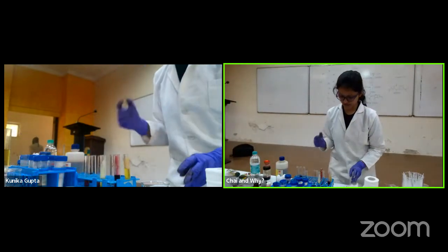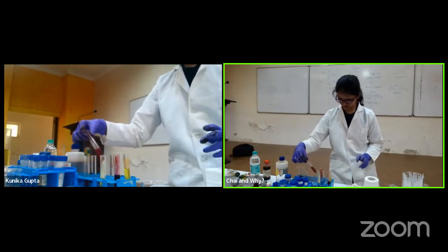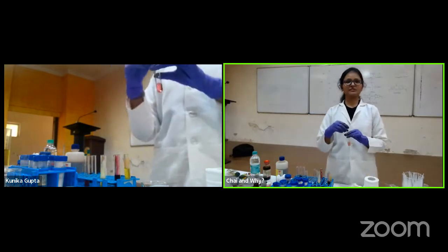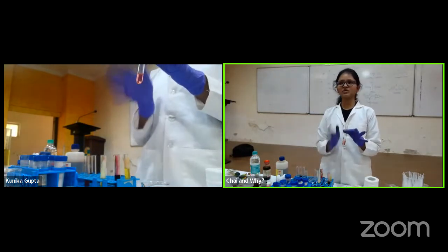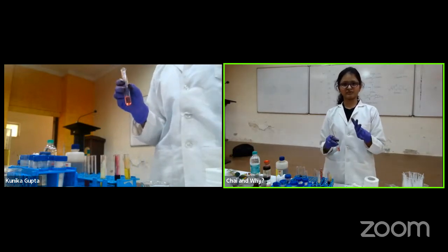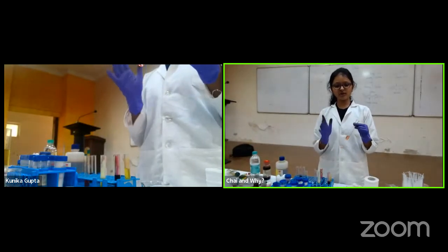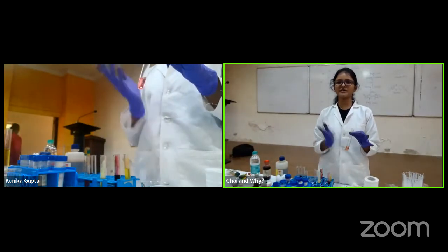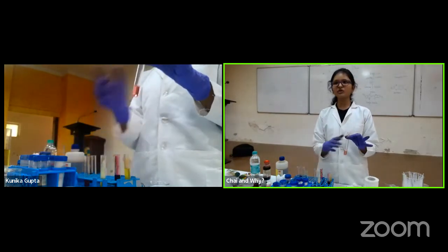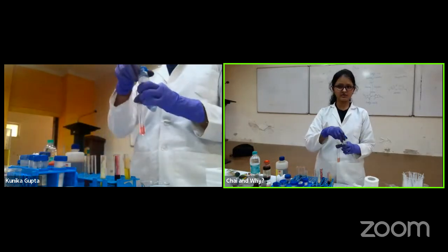So how do I purify it? I'll take this thing which I had shown you. Okay, so this is in DCM. It has acid, it has base, it has some soluble things. Okay. Now you know acids and bases dissolve in water. Fine. Now you may wonder why I didn't add sodium hydroxide earlier, because the sodium hydroxide was dissolved in water, so it would not mix. So now I'll add water to it and it again should not mix, right?